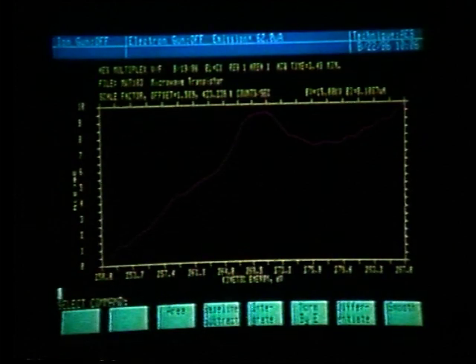I should also point out that if there is a massage function which is assigned to a soft key that is not valid for the type of display that we are using or for the type of data that we are manipulating, that key will be masked. Notice soft keys number 1 and 2.